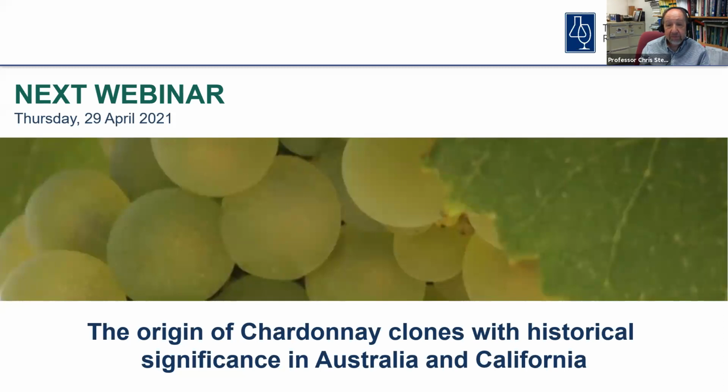Okay. You talked about the Botrytis antigen detection method plateauing out when you got to high levels of Botrytis. There's a question about what the upper limit of Botrytis infection is for that method. Well, really, there's no upper limit, because you just dilute the sample and you bring the curve down till you've actually got that linear graph.